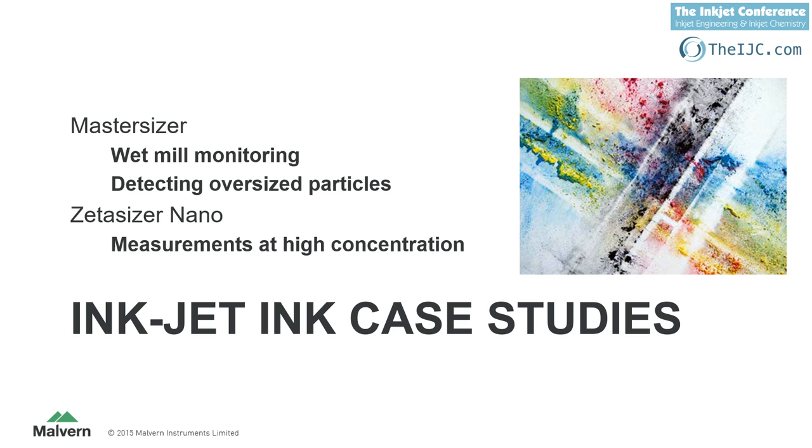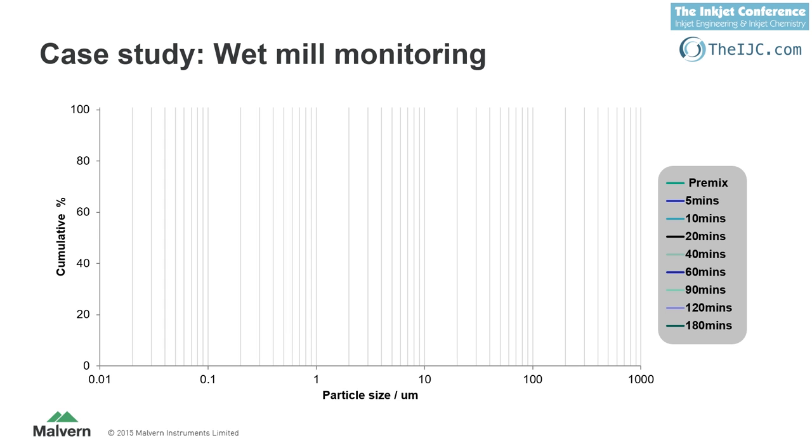So the next bit we'll look at is a couple of case studies on both the Mastersizer and the Zetasizer. So looking at wet mill monitoring, detecting oversized particles, and how we can measure at high concentration.